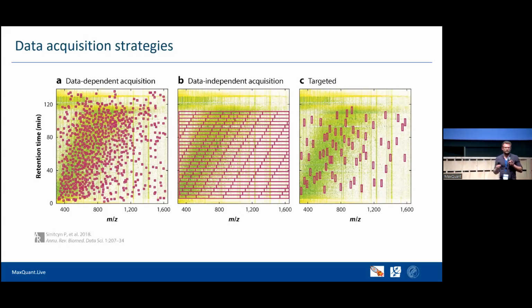So if you're really interested in one protein, or let's say peptides, then you can schedule the fragmentation, and as you can see, they are bigger. So they are fragmented and fragmented and fragmented again. And that has some reasons. I'll talk about that later. But just keep in mind, when you do your measurements, think about it.